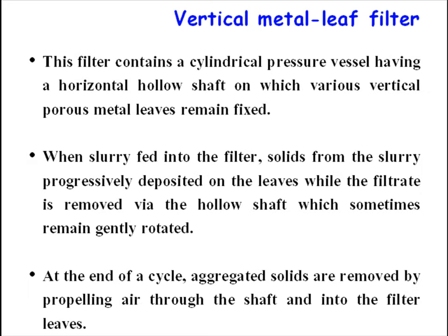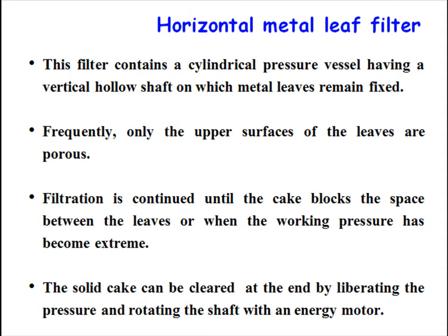Vertical metal leaf filter. This filter contains a cylindrical pressure vessel having a horizontal hollow shaft on which various vertical porous metal leaves remain fixed. When slurry is fed into the filter, solids from the slurry are progressively deposited on the leaves while the filtrate is removed via the hollow shaft, which sometimes remains gently rotated. At the end of a cycle, aggregated solids are removed by propelling air through the shaft and into the filter leaves.